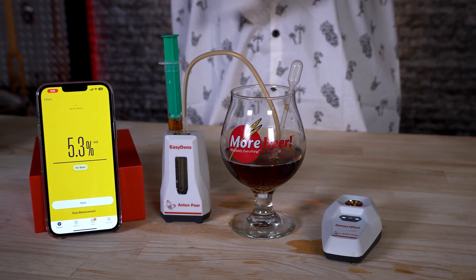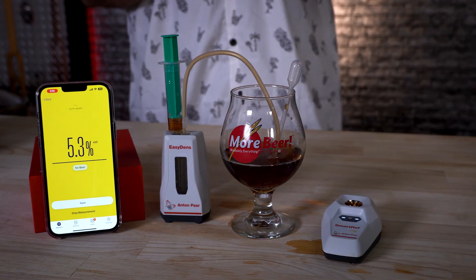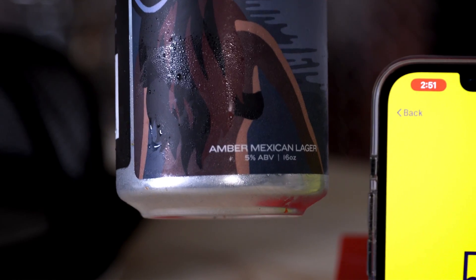What did it measure? 5.3. Once you do that, it's going to feed out your reading. To our surprise, this was amazingly accurate — it pretty much nailed the ABV. It was within the tolerance. There is a variance in the app, and it states that. It says 5 on the label at 5.3 measured. I think that's great. Measured it without any previous measurements — that's pretty mind-blowing.